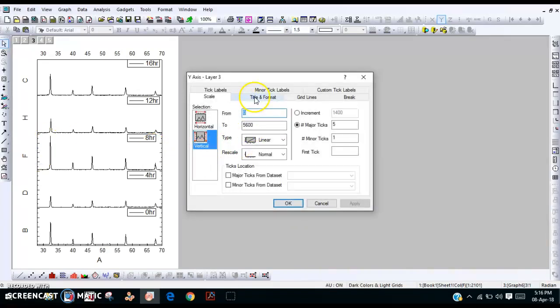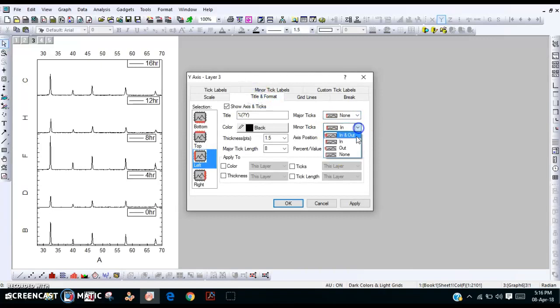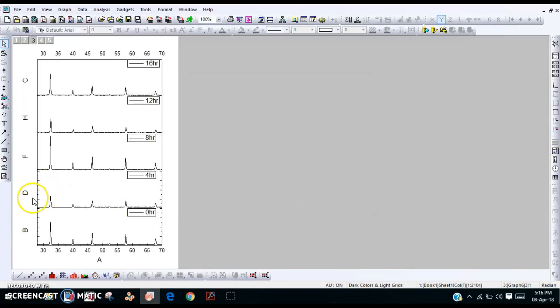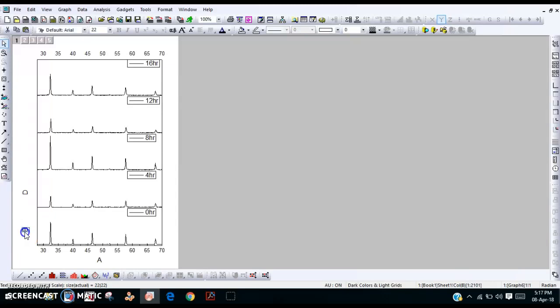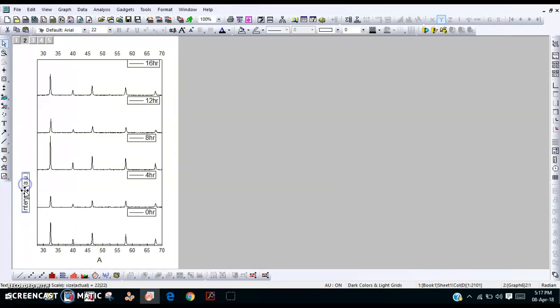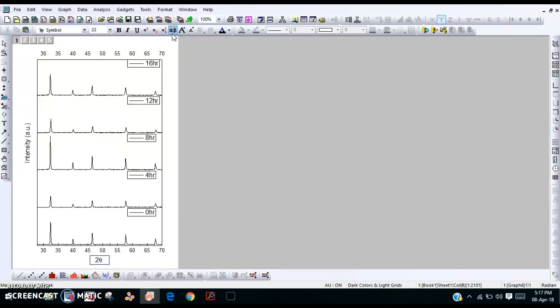Now for each remaining plot, apply the same axis settings on the right side. Once done for all, create the axis labels. The Y-axis label is intensity in arbitrary units, and the X-axis label is 2 Theta in degrees.